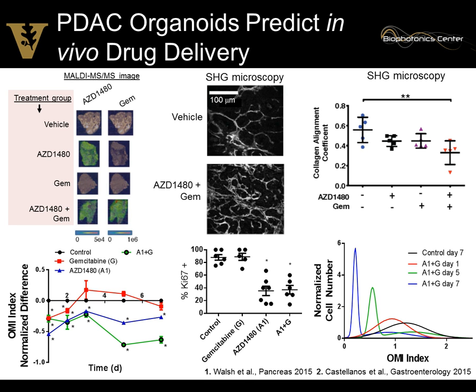Okay, and then this was also a heterogeneous response over time. So if we look at this, control is in black, and then the red at day 1, day 5 is in green, and day 7 is in blue. You can see that the response becomes much less overlapping with control over time. And this sort of agrees with what we see over the time course of treatment.